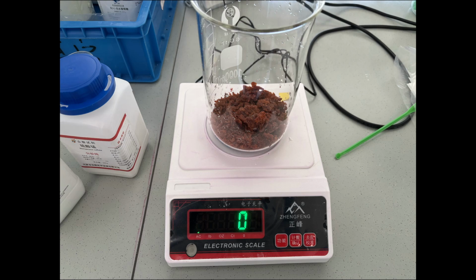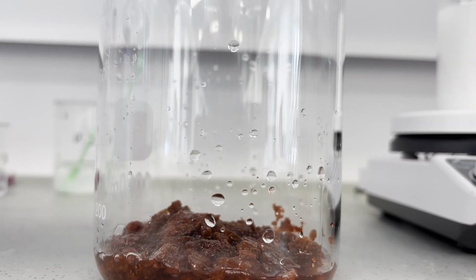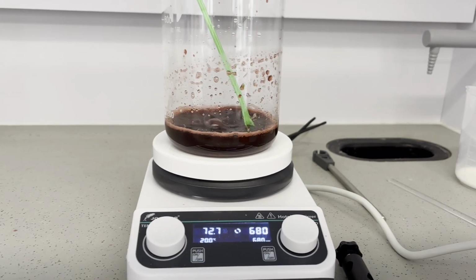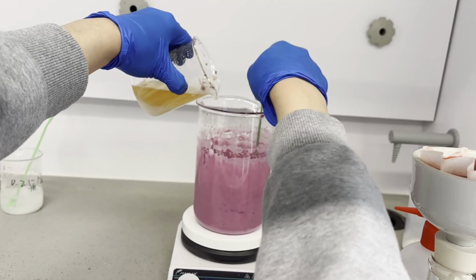Next up, I tried making the carbonate complex, pentaamminecarbonatocobalt(III) nitrate, but failed. I dissolved 100 grams of cobalt nitrate hexahydrate that I made myself with 50 ml of water and added a solution of 123 grams of ammonium bicarbonate dissolved in 150 ml of water, as well as 250 ml of ammonia.